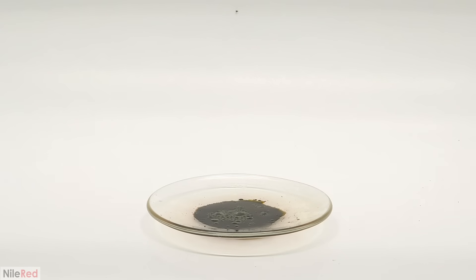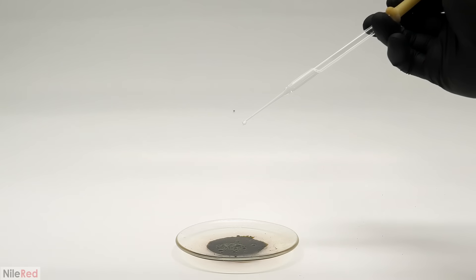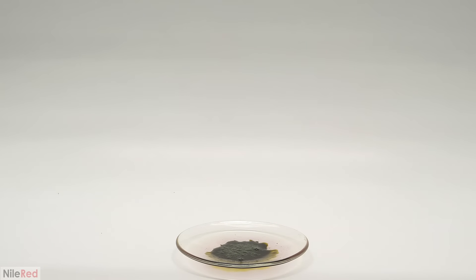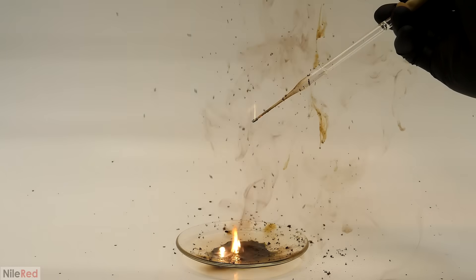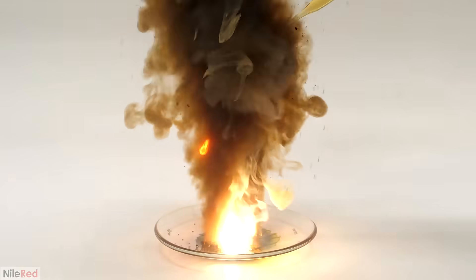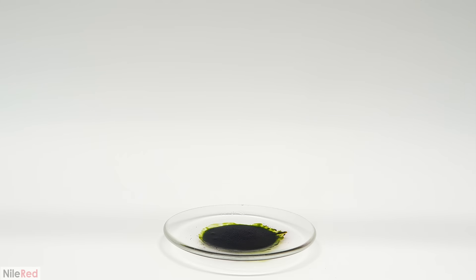I then tried it with ethanol and it had a much higher-pitched and more violent snap to it — I did this one a second time as well and it still had that nice snap to it. For the last try I did it with aniline and it wasn't nearly as violent, but like before I could just feel that it generated a lot more heat.